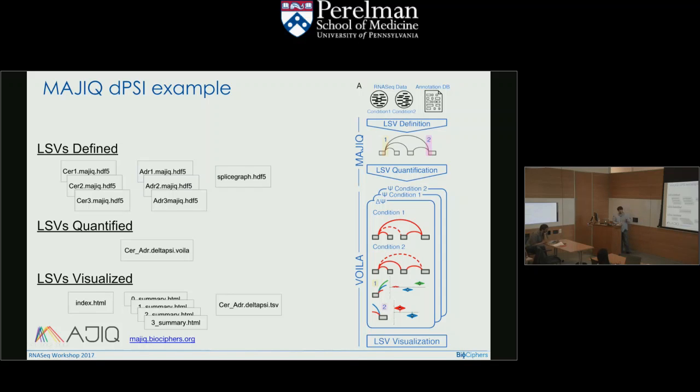But you're exactly right. We start with the annotation database and all the junctions and exons they say as a starting point. We see what we think is there reliably, and we supplement it with de novo things that exist reliably within your data to expand things. Right.